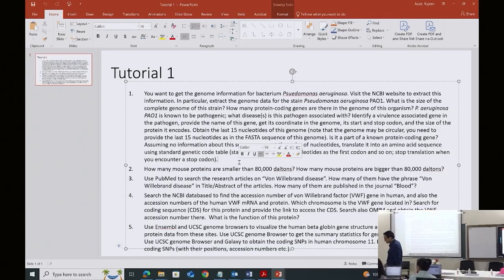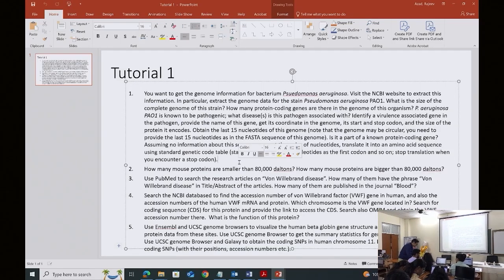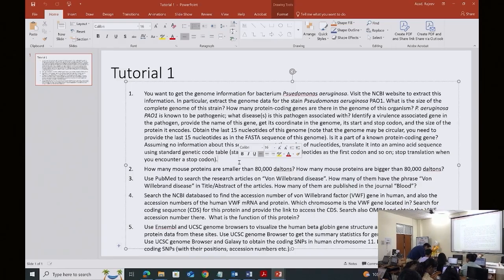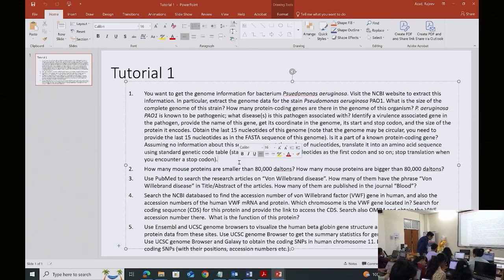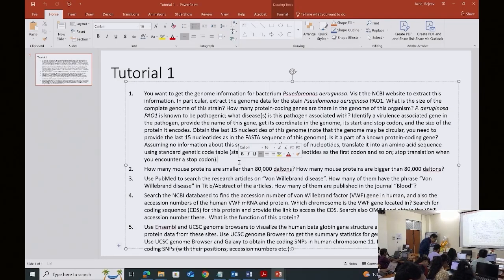After downloading, show. Where did our download go? It is not showing for them. Oh, download it. Yes, sir. Okay, can you? It should show. Yes. Go towards the end. It is still downloading, but it is about to complete. Mine is downloaded, but where will it show? Yeah, the genome will show at the end.